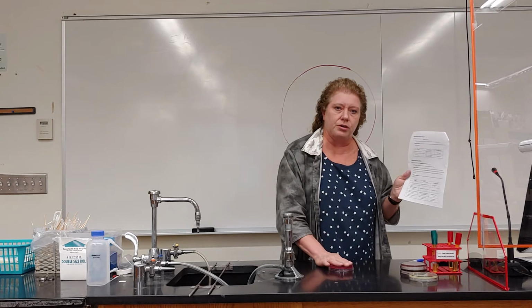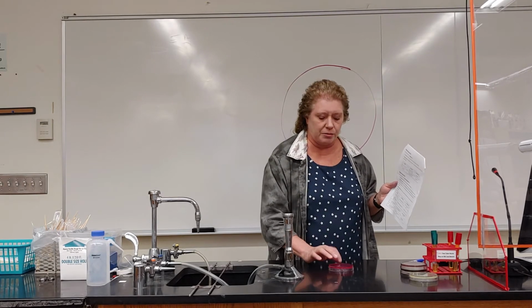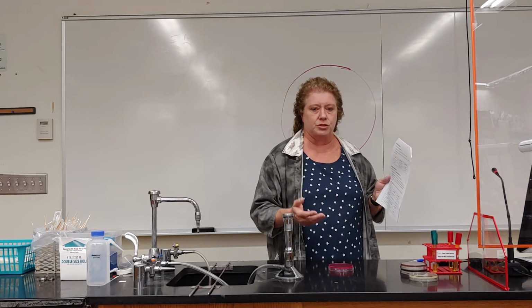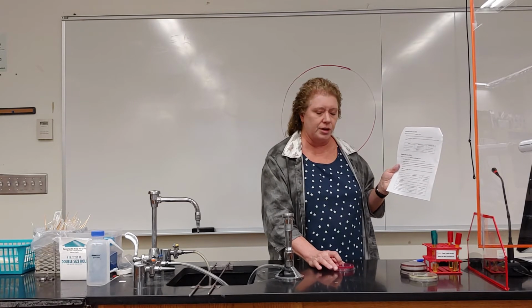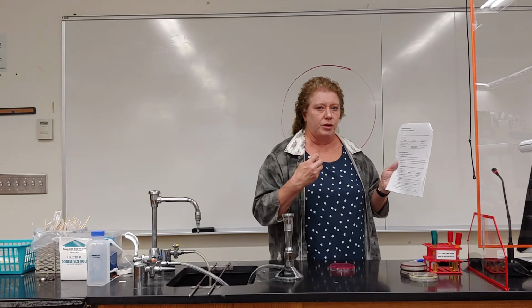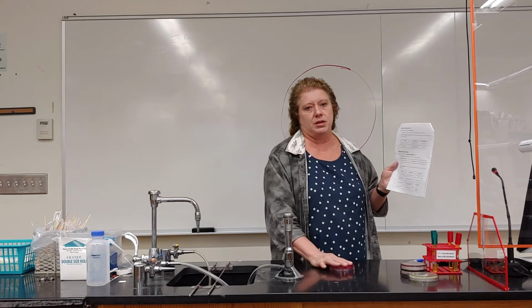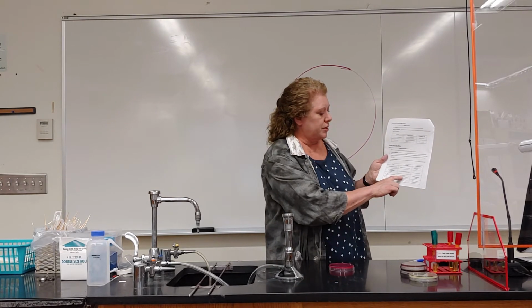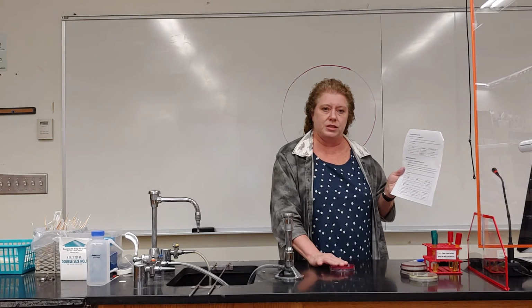So say we put an unknown organism on here, and it grew, and the media turned yellow. And it's a really obvious yellow. There are some pictures of some examples accompanying the handout on Blackboard. So the media turned yellow. That bacteria, when it was growing, created an acidic environment, which caused that media to turn yellow. So that tells you that the organism produces acid from fermenting the mannitol, the sugar that's in here.